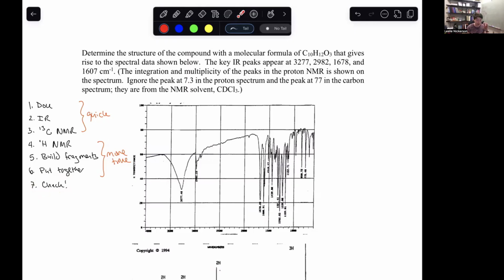I'm going to try to keep myself organized here because I tend to go at it a little bit chaotically, but I'm going to try really hard to rein that in. And I have a table made already, so we should hopefully be good.